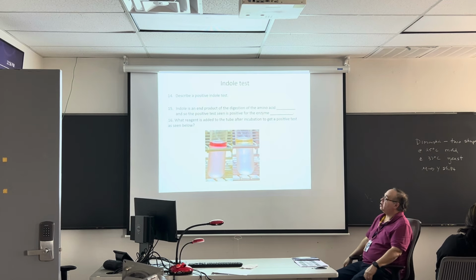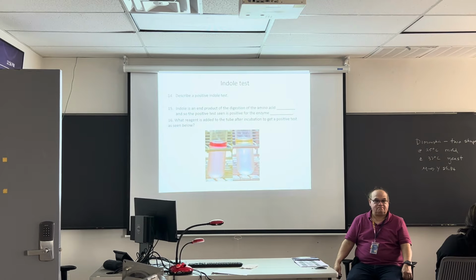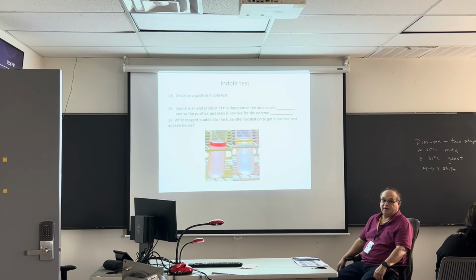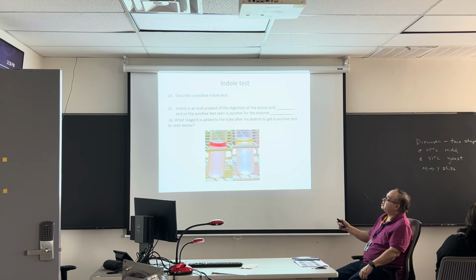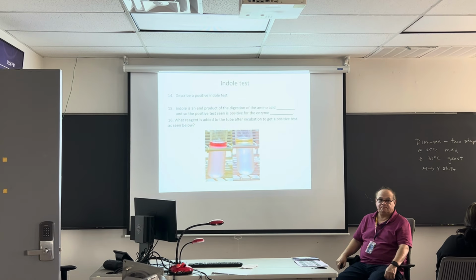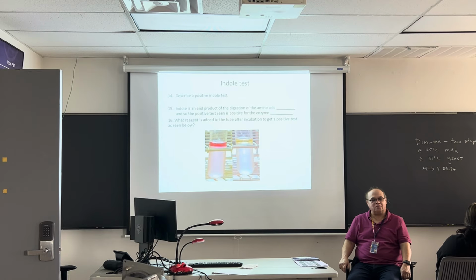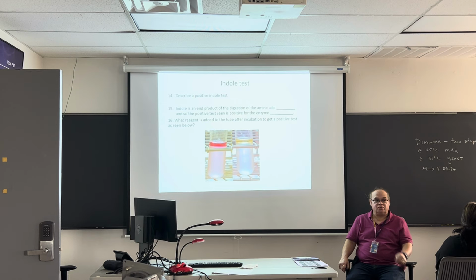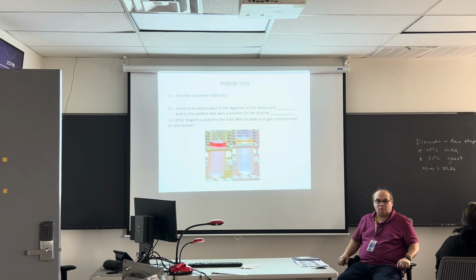Indole is the end product of the digestion of which amino acid? Tryptophan. Right? Tryptophan. And a positive test is a positive for which enzyme? Add ACE to tryptophan, you get tryptophanase. Okay? What reagent is added to the tube after incubation to elucidate a positive test? What's the reagent? Kovacs. Kovacs reagent. Okay? Good?